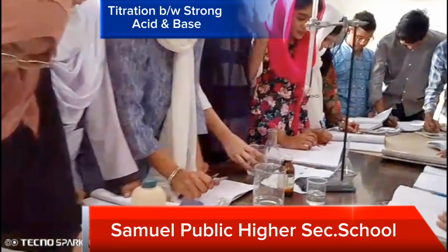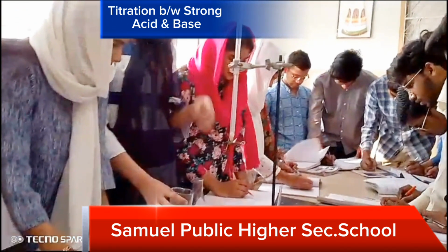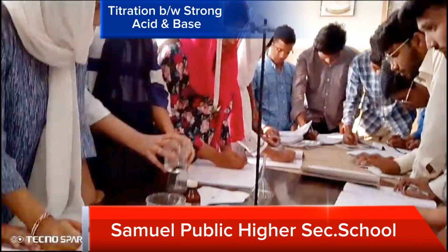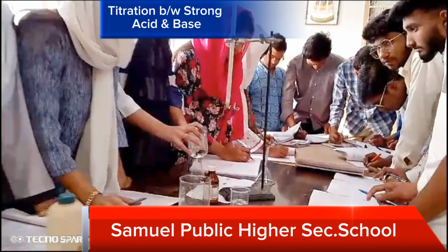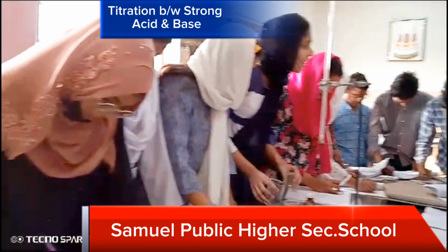Subtract the initial reading from the final reading and calculate the volume of the NaOH. So this is the first titration reading, noted in your observation column.